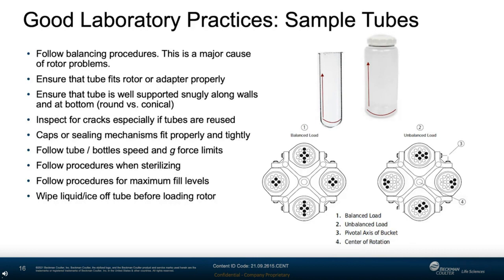I also, regarding tubes, have a quick tube story. One of our ultracentrifuge rotors spins 1.5 mL microfuge tubes at speeds that generate up to 186,000 Gs. Several times I have received calls from users complaining that all of their tubes were crushed during a run. I had to tell them that only our microcentrifuge tube is rated for forces up to 186,000 Gs. All other tubes that I know of are rated for forces no higher than 30,000 Gs.